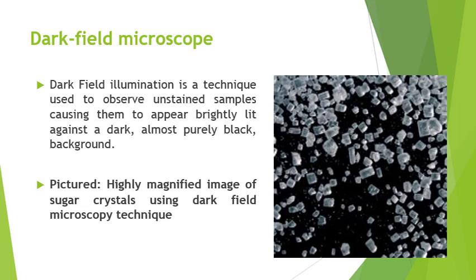So here, this dark field microscope is antagonistic to bright field microscope, or the phenomenon of dark field microscope is totally inverse to the light field microscope, because here the image appears on a dark background. Simply, as you observe in this figure, this is the dark background, and here we observe the image.